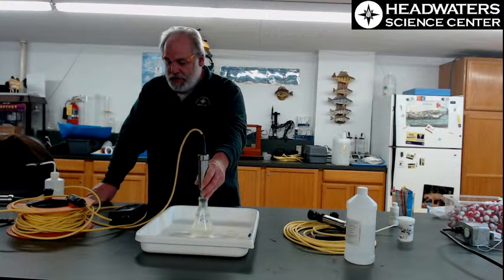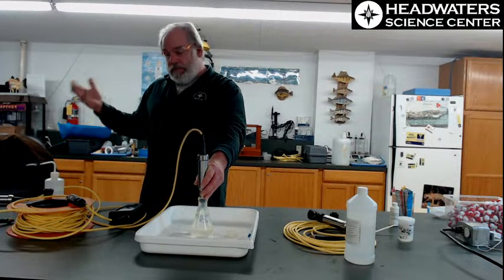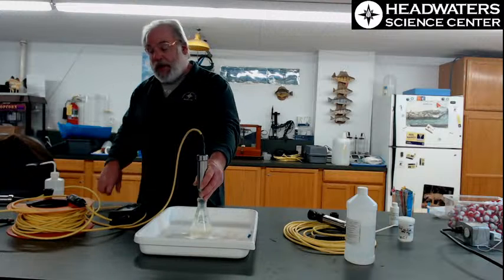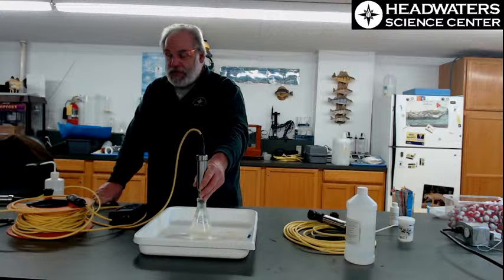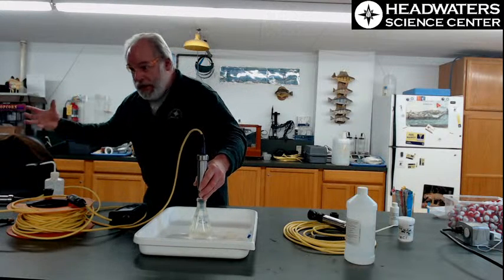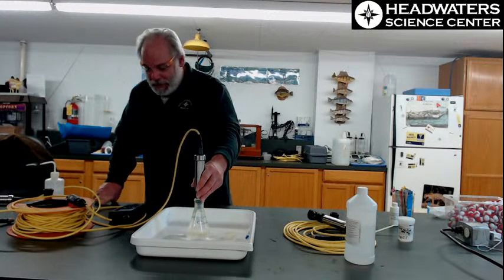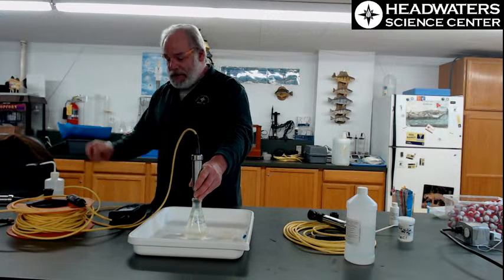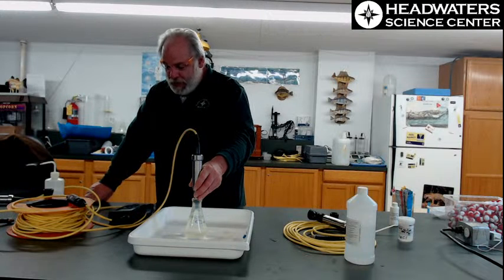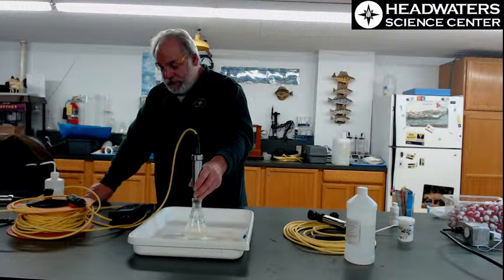We're almost there. I've got about two-thirds of my calibration made. Now, if you just took the meter out to take one measurement, okay, whatever. But if you're going for a day of sampling, I want a good meter out there, because you don't want to waste a day's worth of driving about and getting data. I can remember stories in the field where we had people gathering data and falling down, but they weren't seriously stumbling. I'm just wanting to tell you, the data is precious. The samples are precious. You can't go back and relive a moment, so you have to take a different data point in the universe if you lose a sample, which is why I always take two samples, or enough sample to do more than one measure in the laboratory.